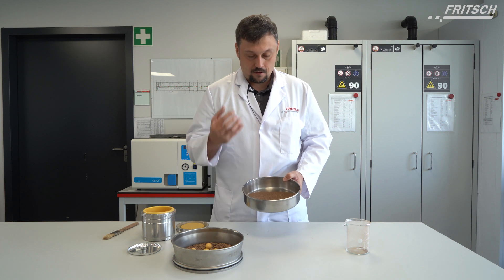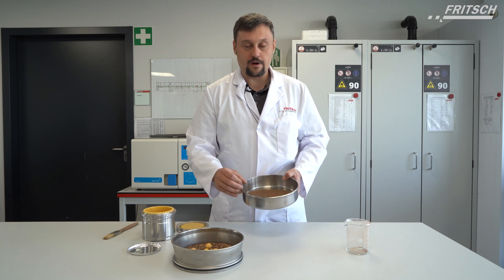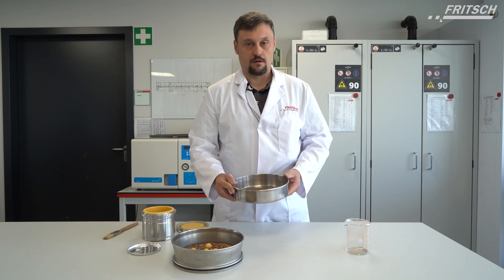My recommendation for analyzing this clay fraction from this sample would be working without balls and with high rpm. Thank you for your attention.